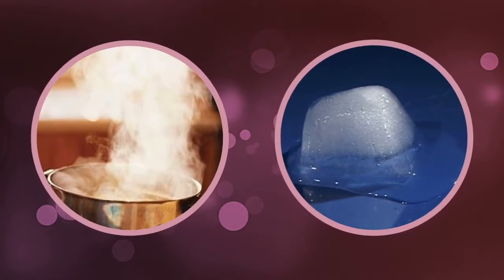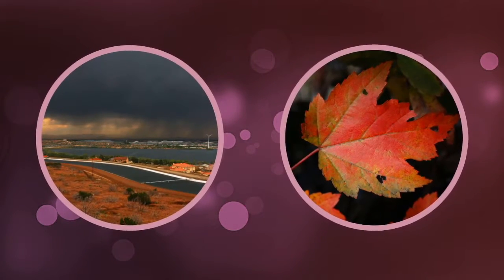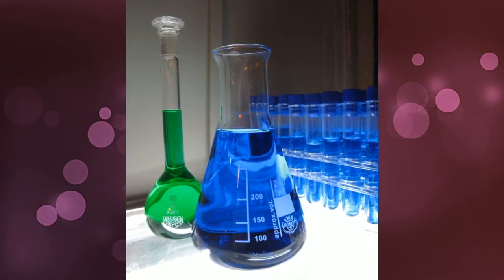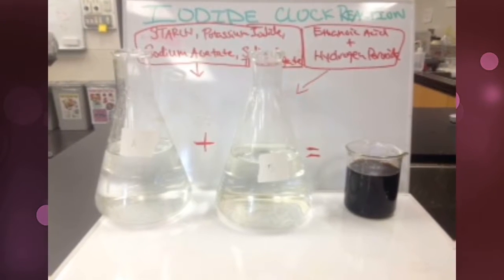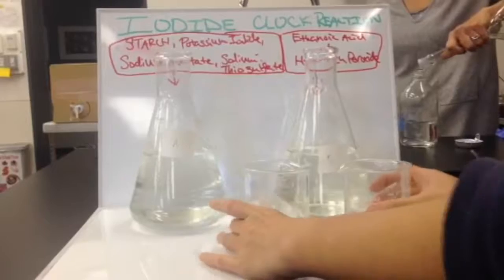We've all seen steam come out of boiling water and ice melt. And we are familiar with the colors of the leaves changing when it's fall. These are all examples of chemical reactions. But when do you know if a chemical reaction has occurred? The iodine clock reaction is an experiment that has a clear indication that a chemical reaction has occurred.